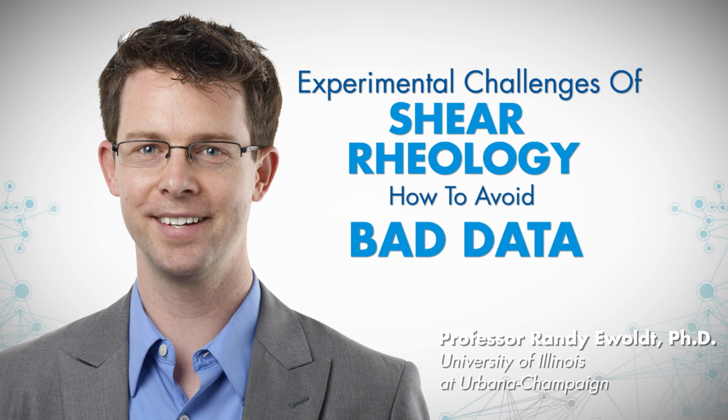I would still plot a Reynolds number limit, because that's what's going to cause these other effects. For example, at a higher Reynolds number, it'll change the pressure field, which will change your normal force, etc. If you really care about precise normal force measurements, you do have to worry about other things, and I'll list a couple of them here.